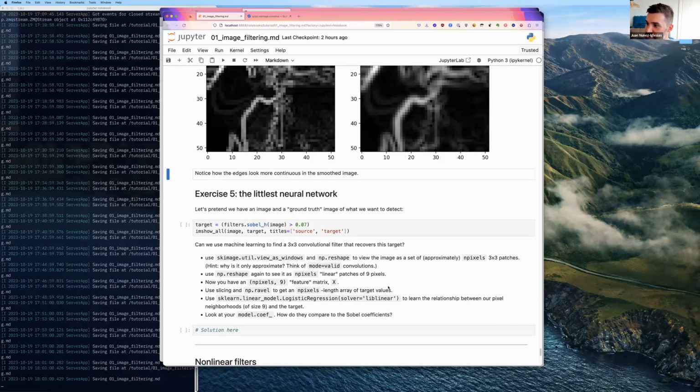Okay, so for the last bit, this is normally quite a long exercise. I'm going to skip it because there's not that many people experienced with Python here. Sorry, by skip it, I mean I'm just going to do it myself, and then you guys can go and review it in your own time.